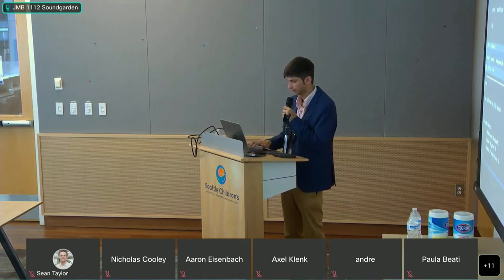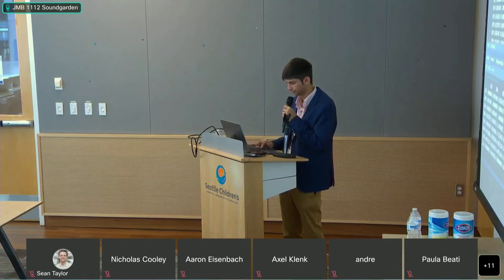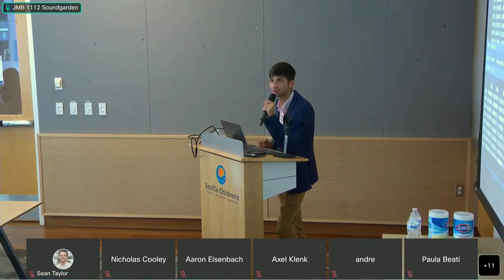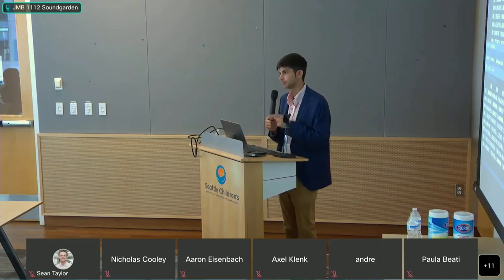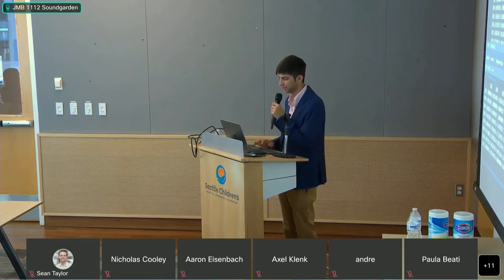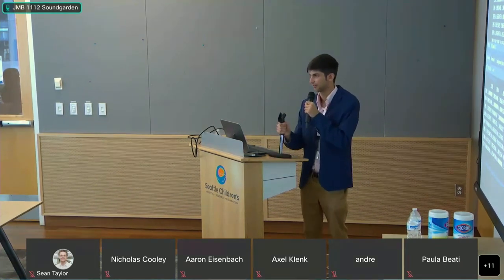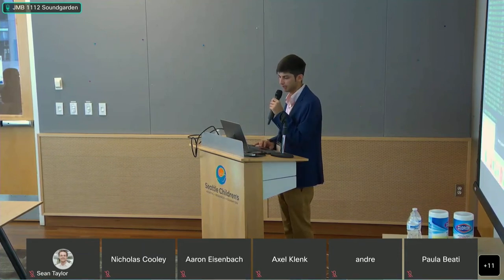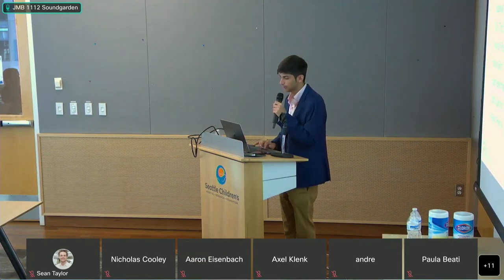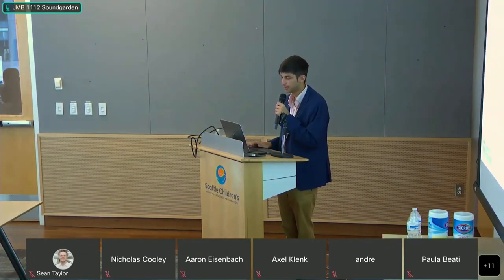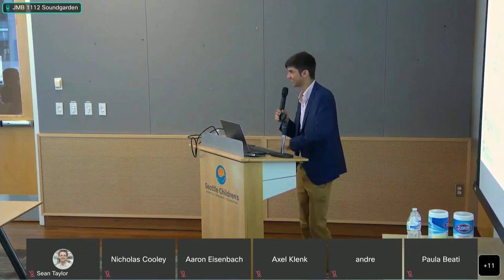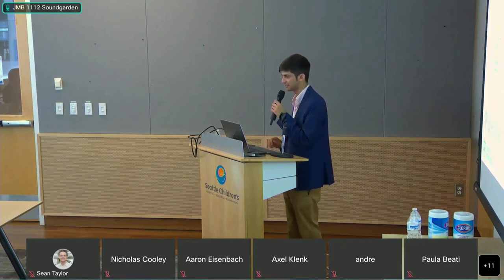The output shows fairly low correlation across the board for these. Is there a way to see the individual residues — which positions are co-varying? Not yet, but that's a great idea — I'll add that in. I'm taking notes as we do this for the next release cycle. This is fairly early stage — the newest addition to SynExtend, very recent. The rest of the package has been around for a long time and is very stable. ProtWeaver will get much better with every release cycle.